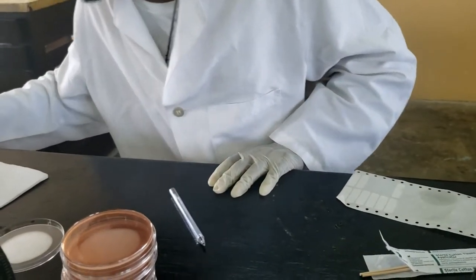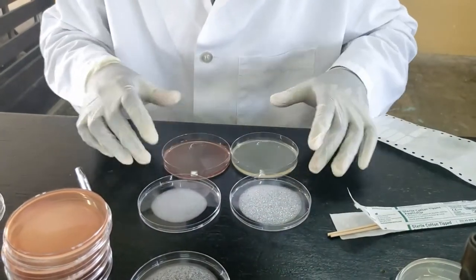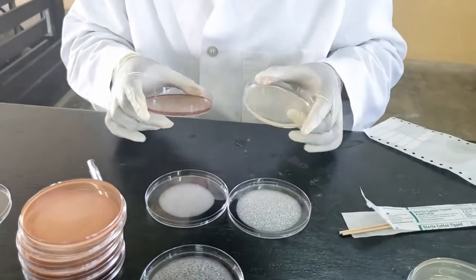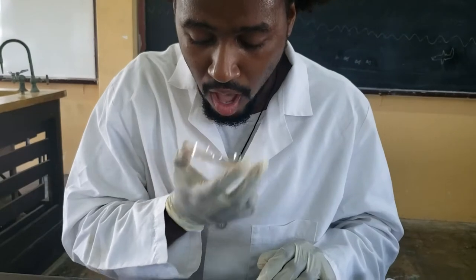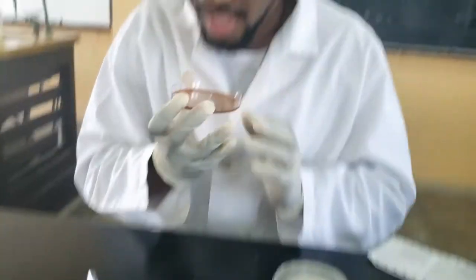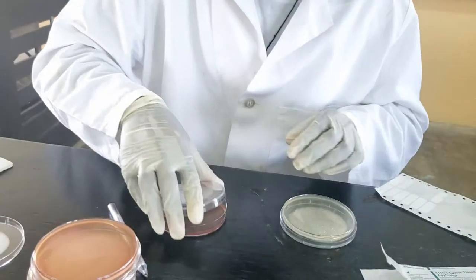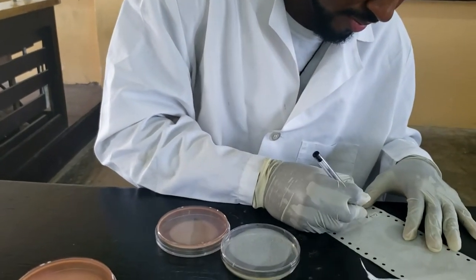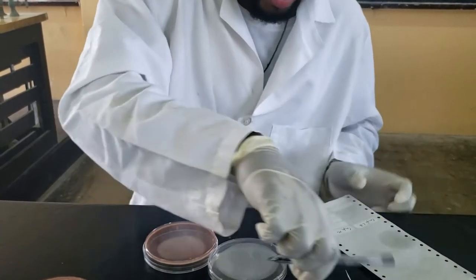Next, we have to cough several times over each plate. I know this can be a bit risky. I don't have COVID, or at least I don't have any symptoms as yet, so I'll just cough. The virus won't grow in it, only bacteria. Again, I don't have COVID. MacConkey.